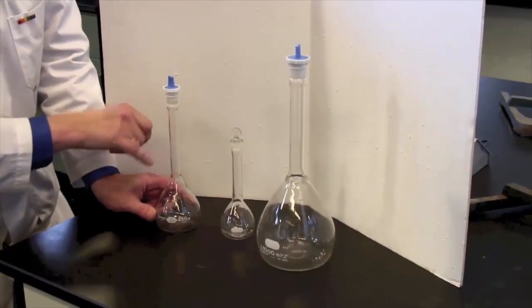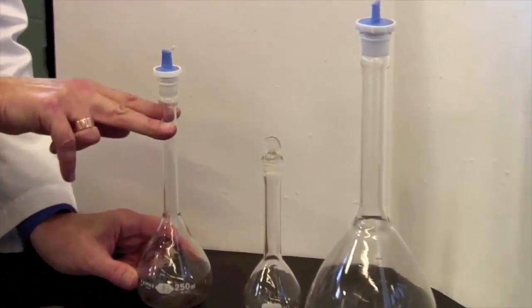And the calibration line is in the narrow portion of the flask, so that changing the volume by a small amount changes the level of the liquid by a large amount. And that helps you be more accurate in measuring volume.